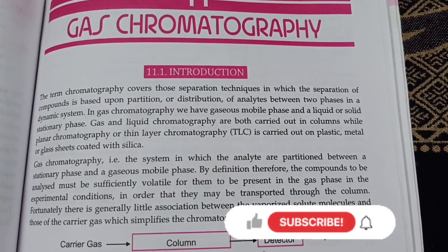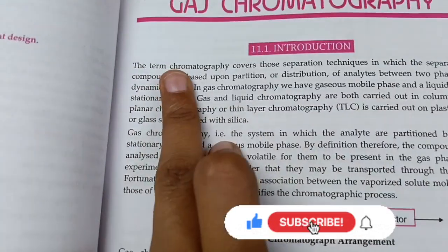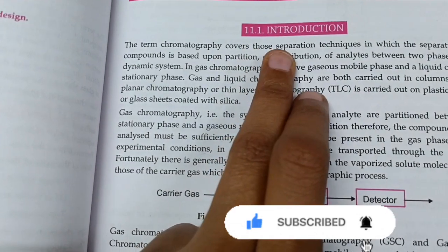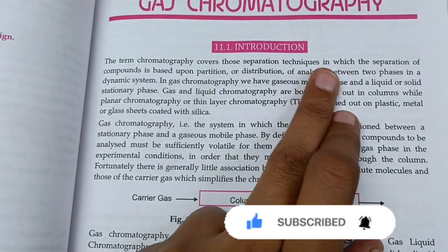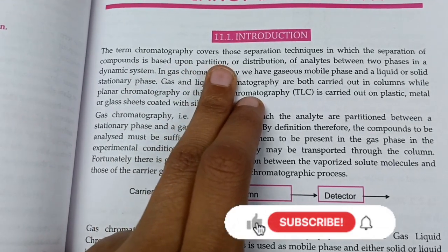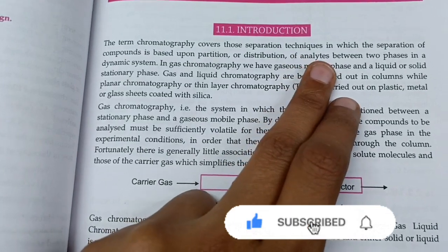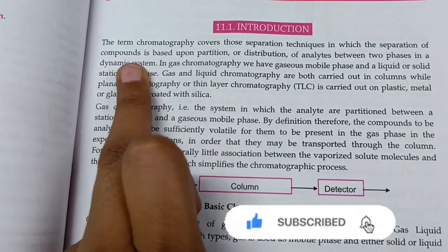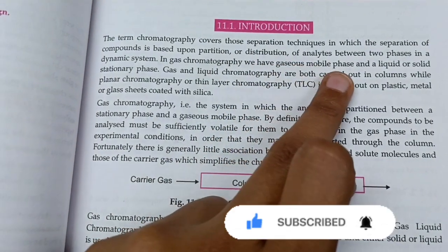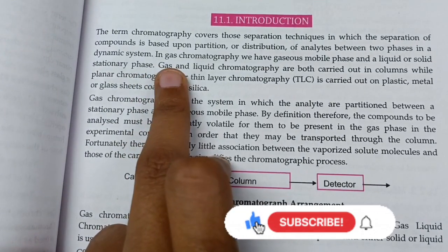Hello everyone. Today we will study gas chromatography. Introduction of gas chromatography: the term chromatography covers those separation techniques in which the separation of compounds is based upon the partition or distribution of analytes between two phases in a dynamic system. In gas chromatography, we have a gaseous mobile phase and a liquid or solid stationary phase.